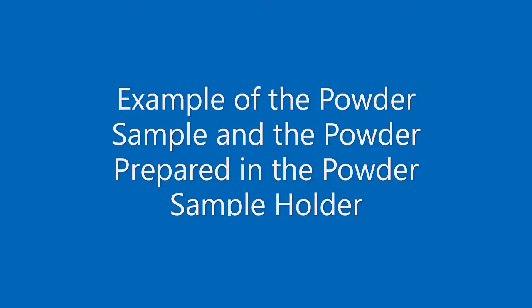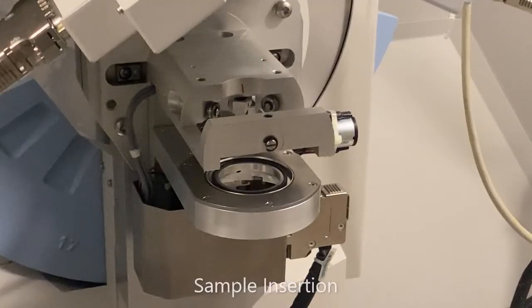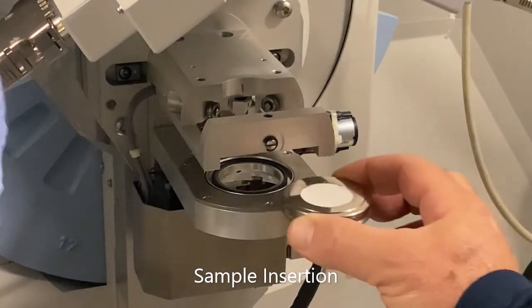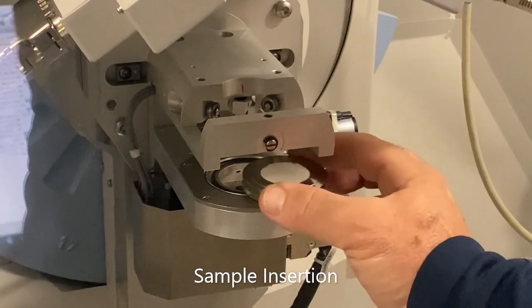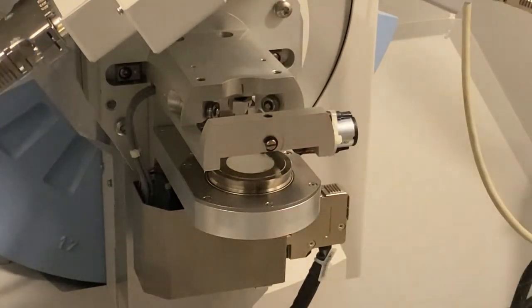Here we show a photograph of this type of powder diffraction sample that we will be using in this lab experiment. Let's now demonstrate how the insertion of the sample takes place. The sample is a small puck of the powder that's mounted inside of a ring holder, and the ring holder is inserted into the bottom platform. It's aligned there, and then the bottom platform is raised to bring the sample up to the proper diffraction height.